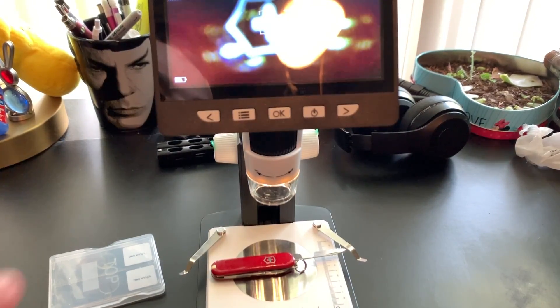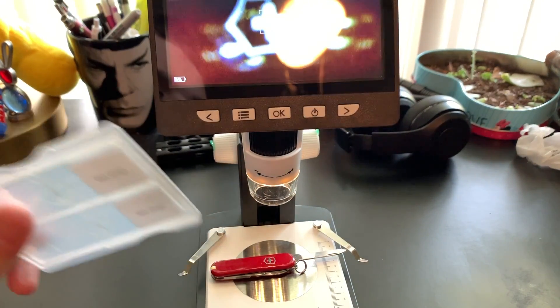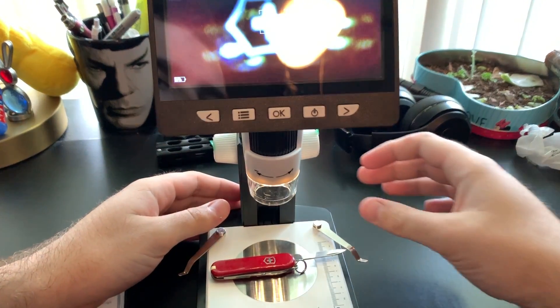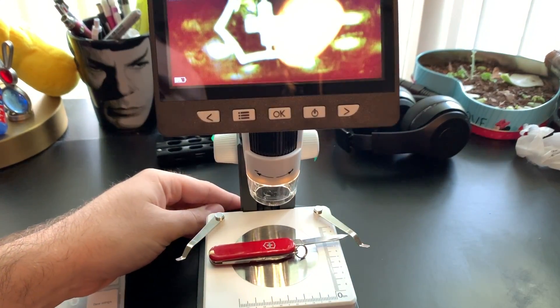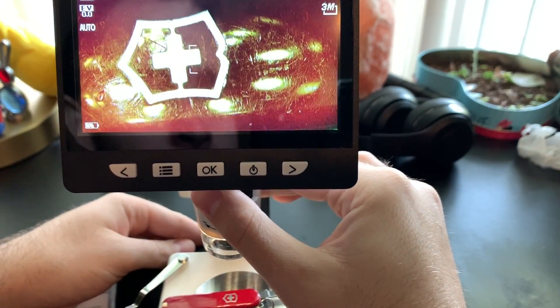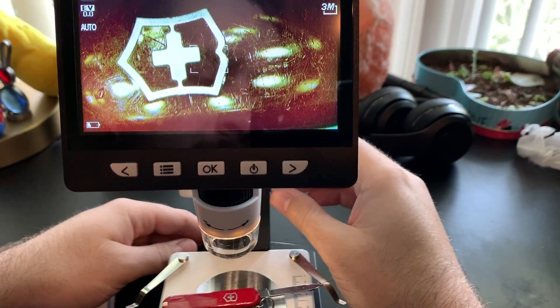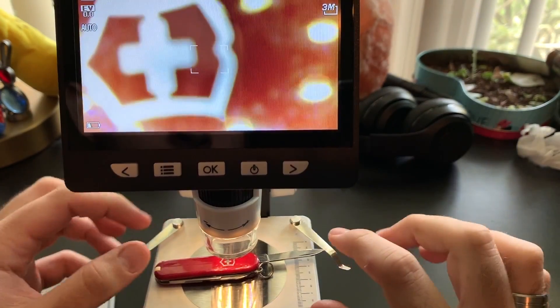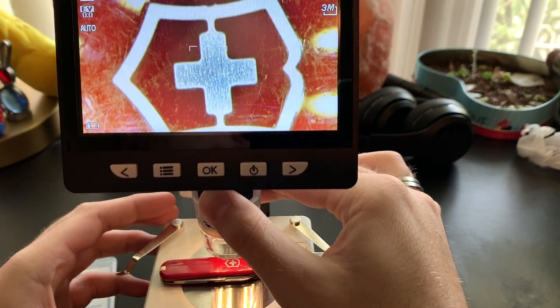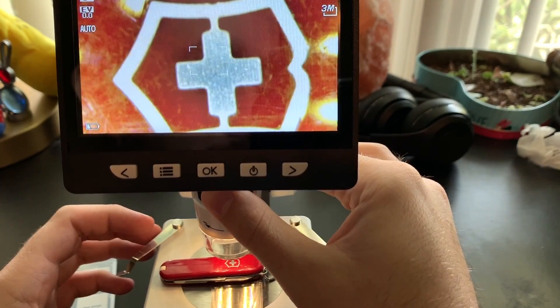Now we're going to test this Swiss army knife on here. I tried the bee wings and they do look very cool, but it's really hard to capture on camera. This might be a little easier. I'll bring the focus up just a little, move it closer so you can see the screen, and adjust it a bit. You can get a much better focus — it doesn't do it full justice on camera, but you can get a very, very clear image. You just have to adjust a bit to get where you want.